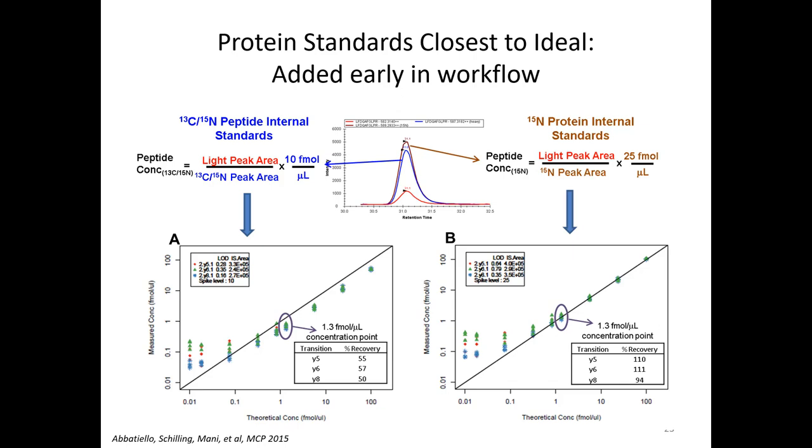Most of them had different product ion m/z values than the heavy C13 and N15 peptide, and then the red is from the light. This was awesome because Skyline was able to handle this data. This was probably one of the first times we were able to do this.